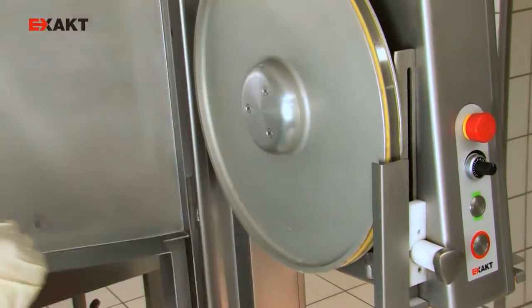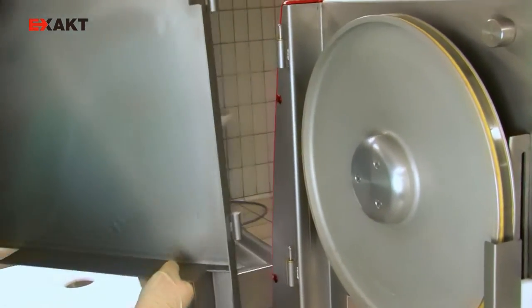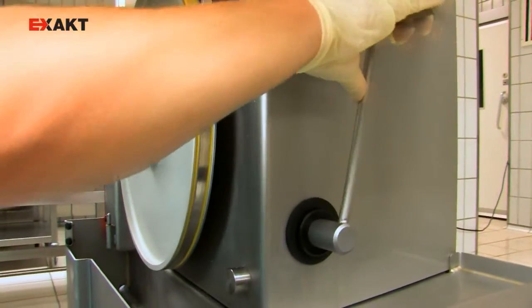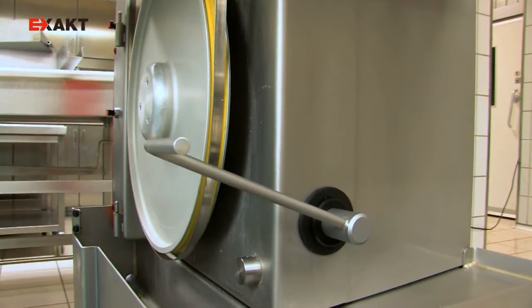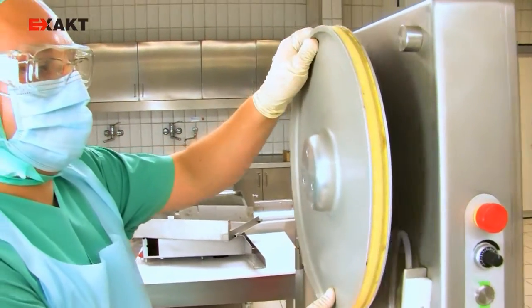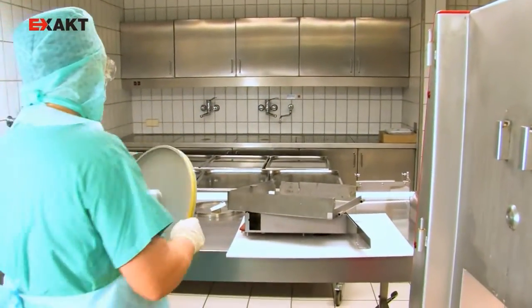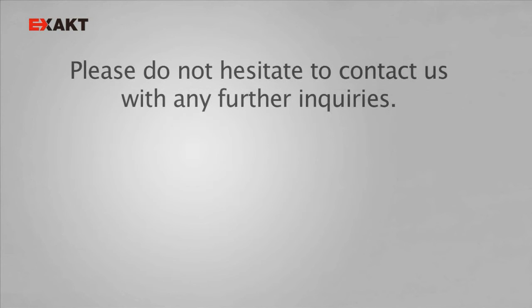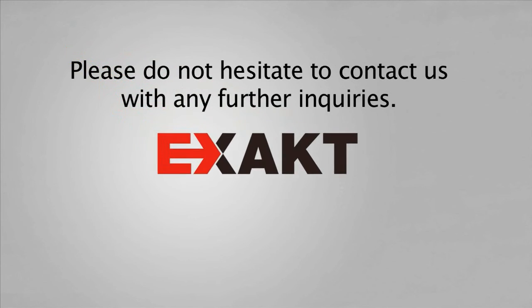The saw can be opened without any tools, and all of the individual parts are easy to detach. I think this product will catch on in the pathology branch. We would like to thank Dr. Henning Stein, senior physician at the pathological institute at the clinic, for his support. Please do not hesitate to contact us with any further inquiries.